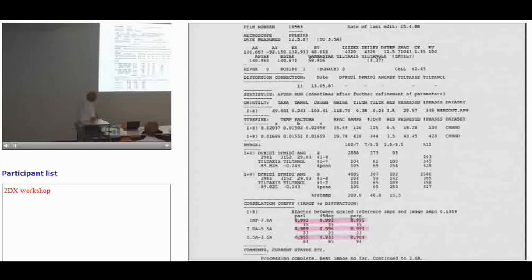So the idea was you write down everything about it, but you have data that proves it. So this would be the first pass, and this would be the second pass in terms of the unbending. And we had the defocus, the astigmatism, and so on and so on. And H is the height of that peak in the middle of that 9 by 9 box, with the background adjusted to be about 7.